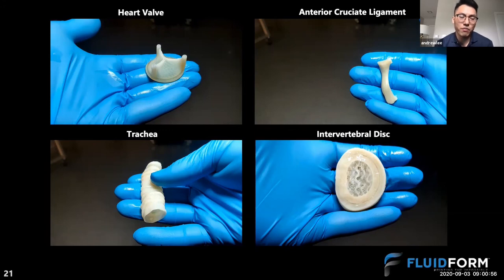And so the next steps will be to start to tune some of the material compositions, start to think about different ways of printing the structure, so you can align some of the print filaments in the direction of force loading, and then start to test the mechanical properties, say starting with the Instron with very simple stress strain curves.